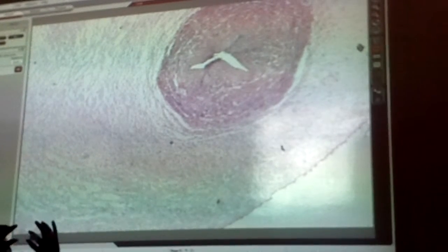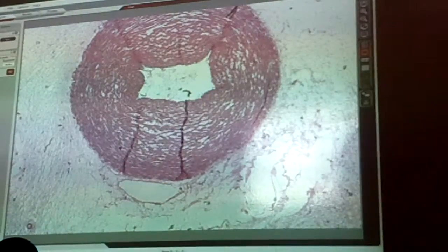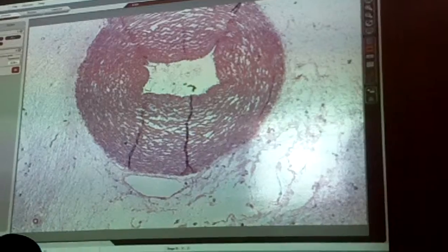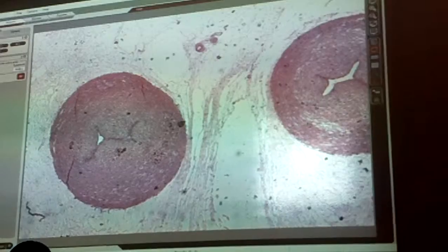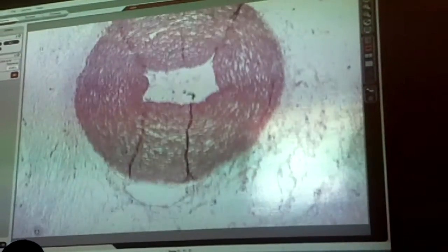All these circles look pretty similar to me in my slide. Should be 2 that look the same, and then one that looks different. Okay, this comes out of y'all's boxes. There's those. And there's that one. That one looks different. It looks more fibrous, like spread apart, fluffier. Yeah, fluffier than those 2. And the lumens aren't very clear in the arteries, whereas in the vein you can see a fairly good lumen.